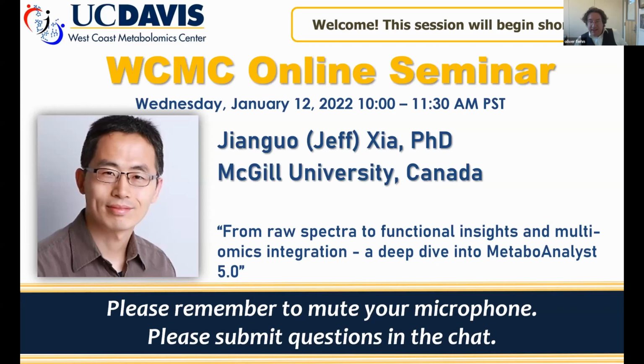And today we are pleased to welcome him for his talk, From Raw Spectra to Functional Insights and Multiomics Integration: A Deep Dive into MetaboAnalyst 5.0. So that's the latest version of MetaboAnalyst.